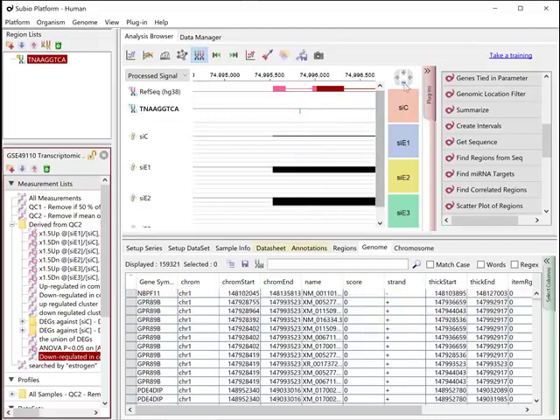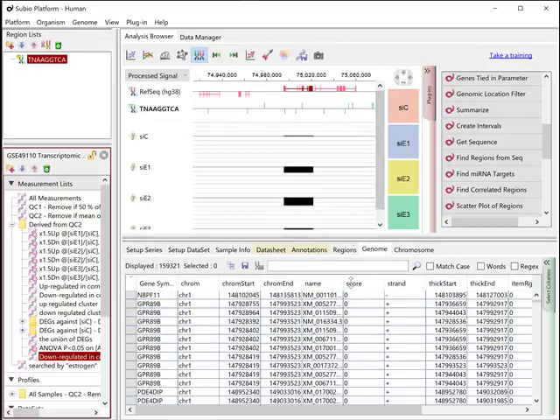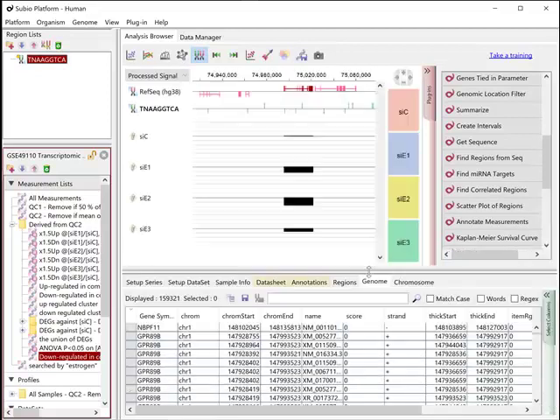The counts of the gene at the control is about 1,000, and it can go down to several hundred by the series.